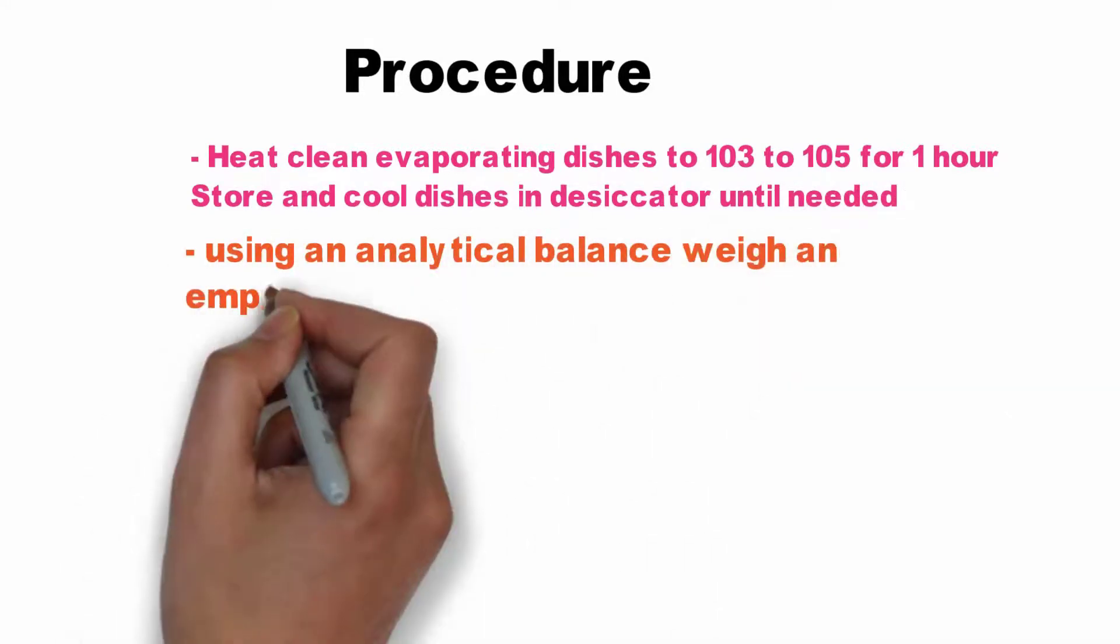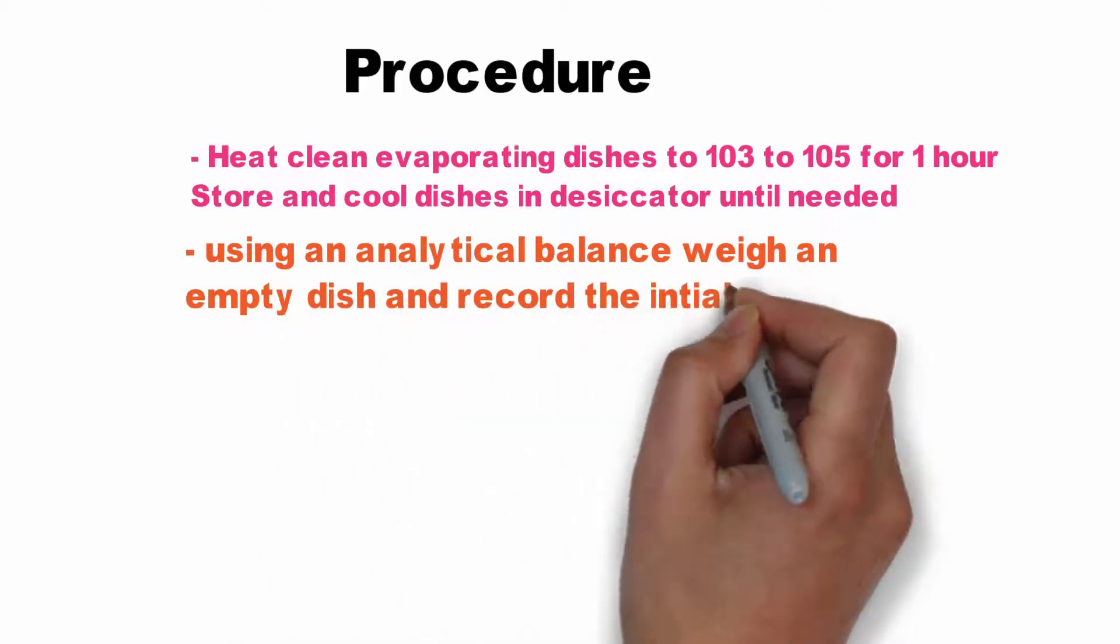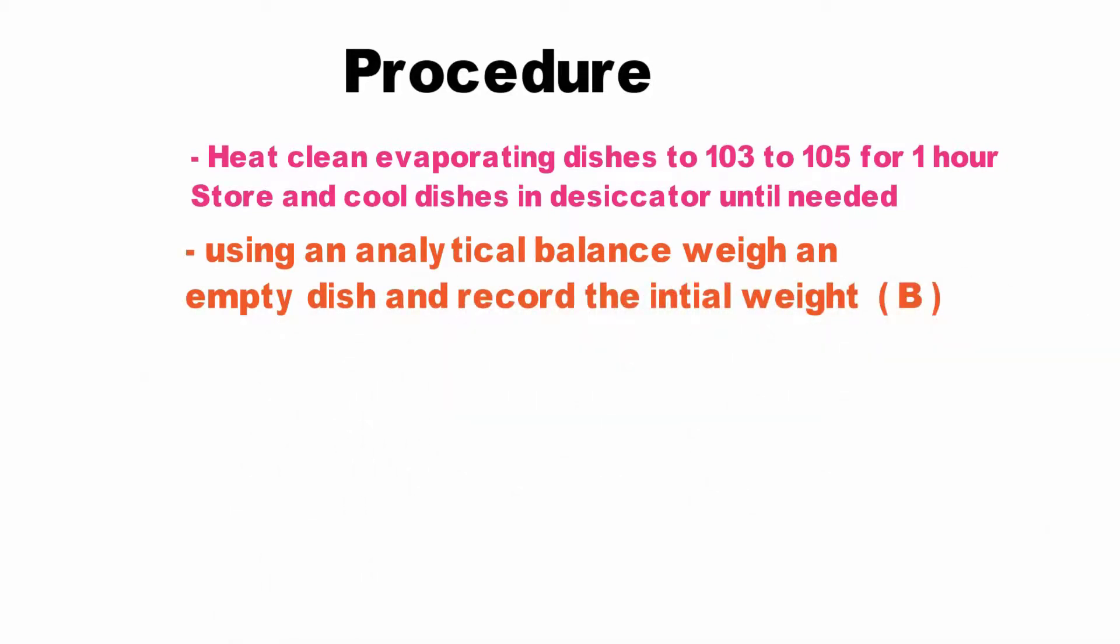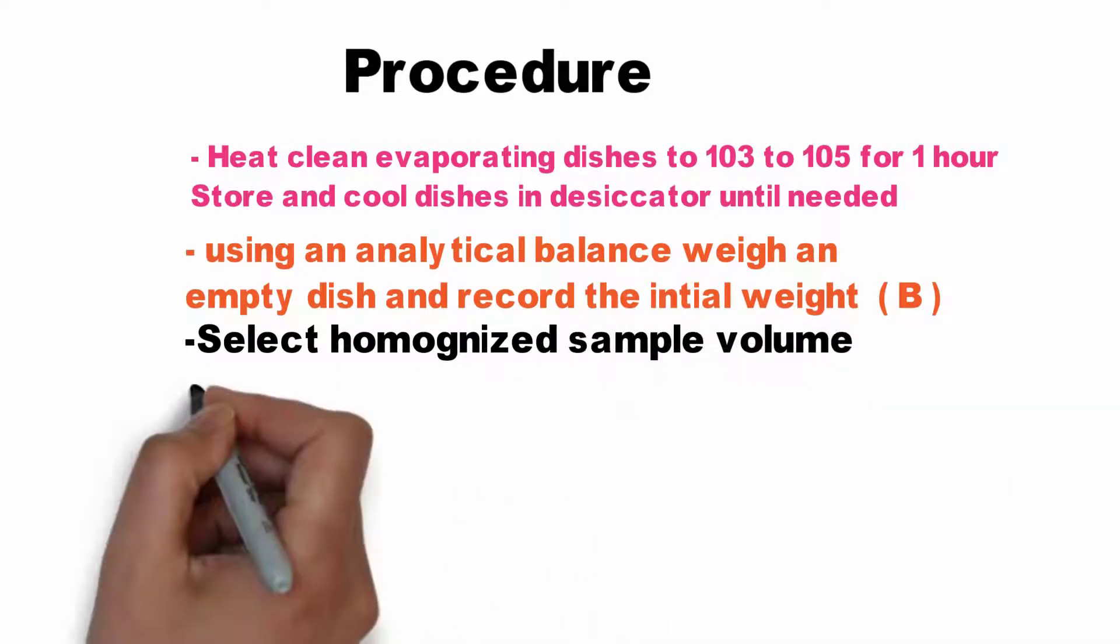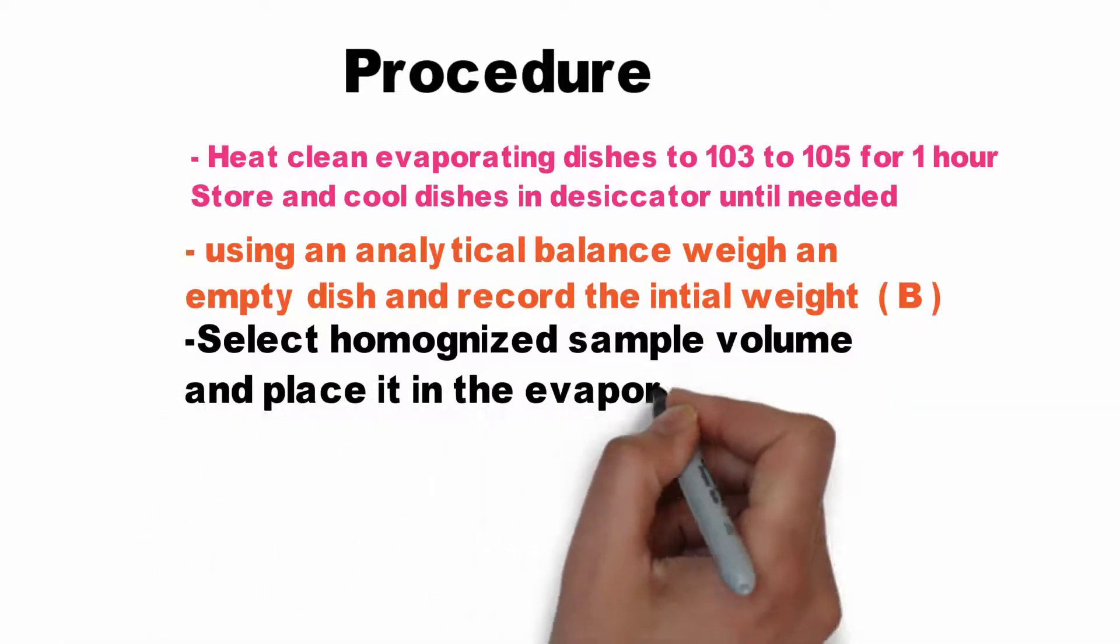Using an analytical balance, weigh an empty dish and record the initial weight. Next, select a homogenized sample volume and place it in the evaporating dish.